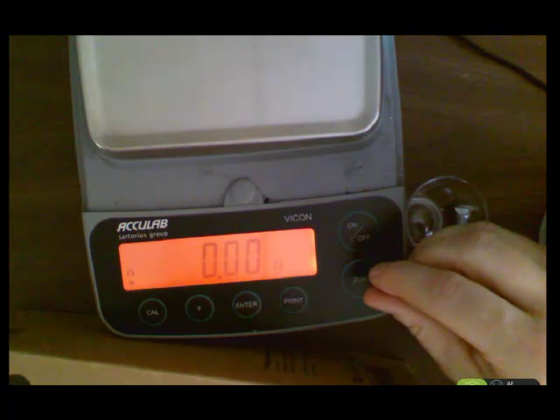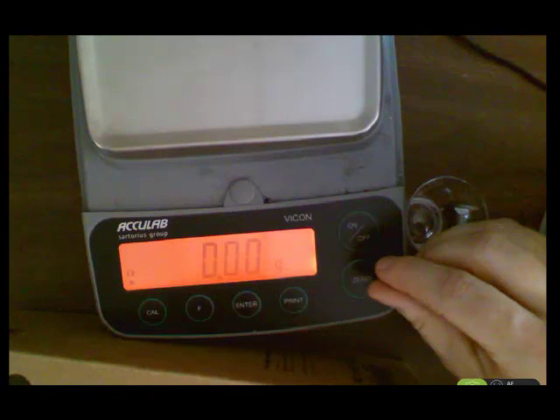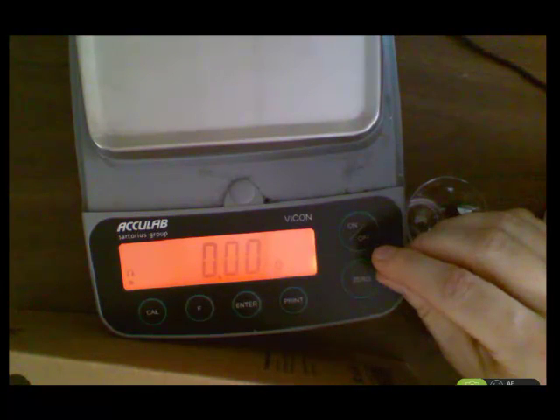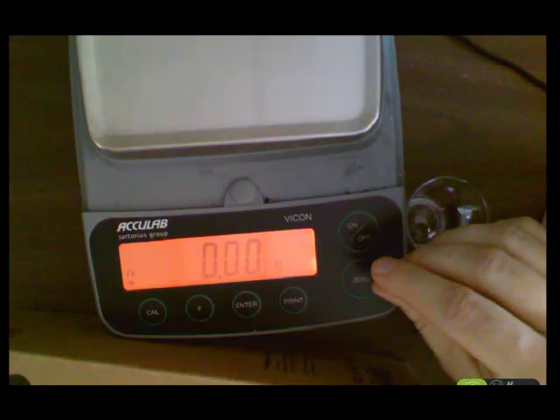Now, these balances need to be calibrated. There's directions for balance calibration on little cards that are located near the balances. Just follow those directions. You want to calibrate every so often. Sometimes these balances drift off of the 0 mark, and they need to be calibrated to make sure they're still measuring accurately.